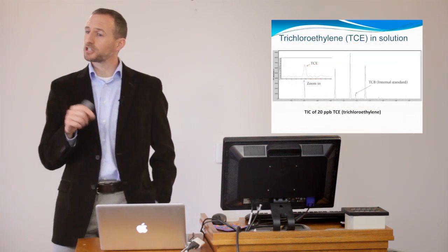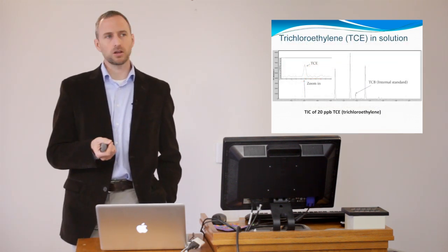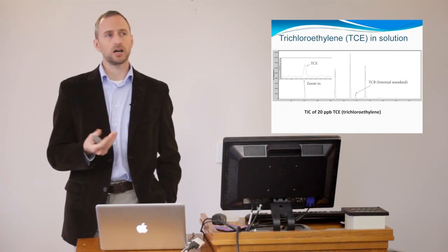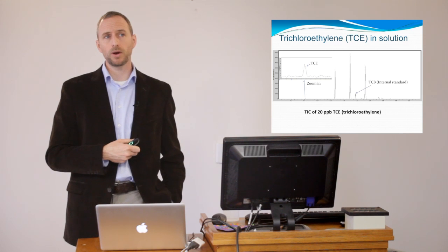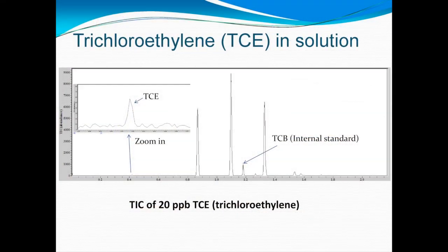This instrument looks to be much better for more volatile components, for smaller molecules, for volatiles. And one example of interest on this particular site is trichloroethylene. This is another organic solvent that's known to be contaminated in the environment there, as on other sites. And what we can see here is these 3 major peaks in this chromatogram are the ones that we know to be present in every run, as they're quite consistent, and we can subtract those or ignore them.